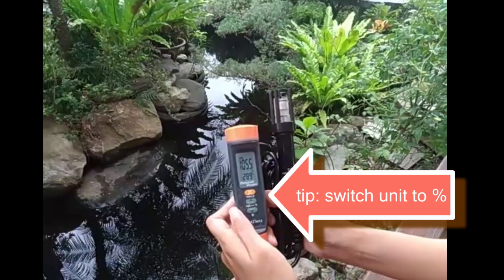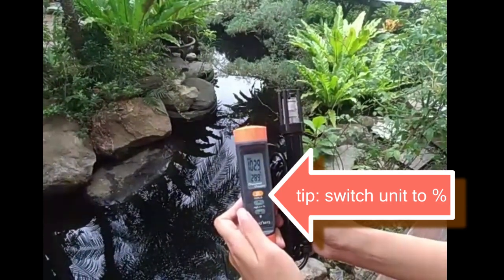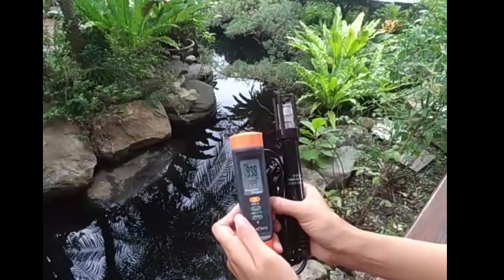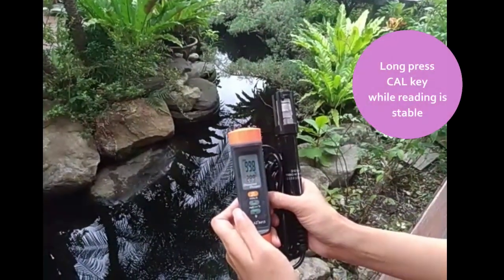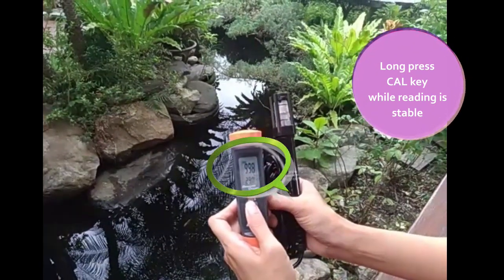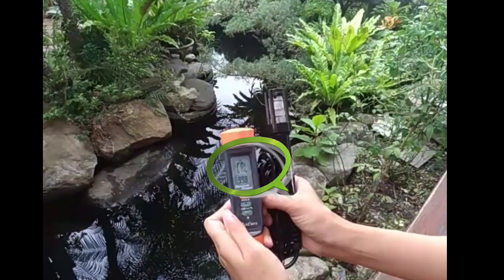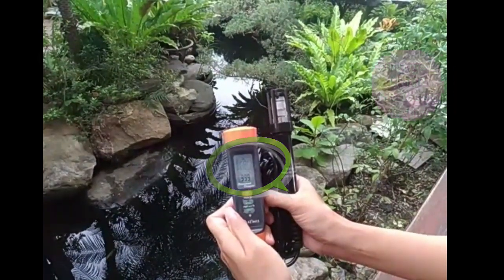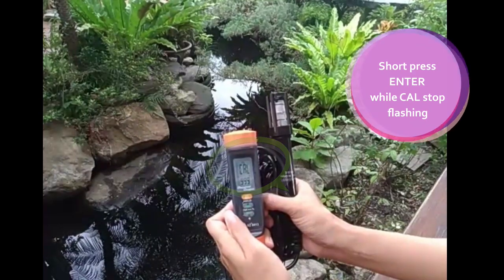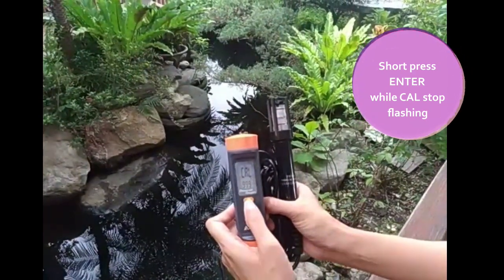In normal mode, first press to convert the dissolved oxygen unit to percent. Place the probe in the air and wait for a few minutes until the reading is stable. Press and hold the key to perform 100% saturation correction — Cal will flash on the screen. Wait for a few seconds to 1 minute until the reading is stable and Cal no longer flashes. Short press the key to complete the calibration.